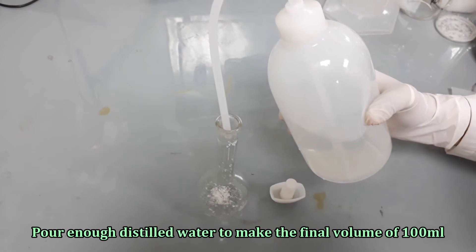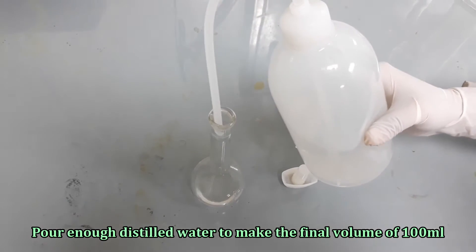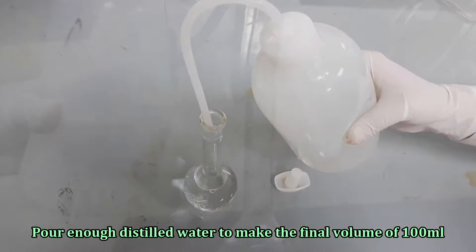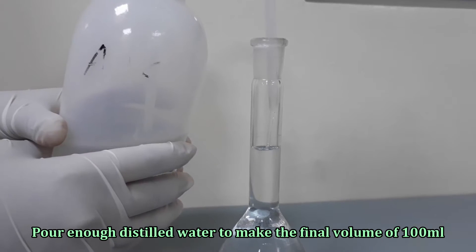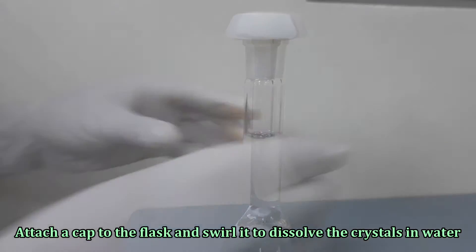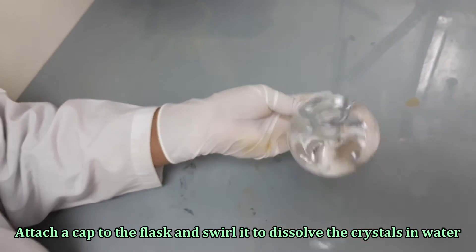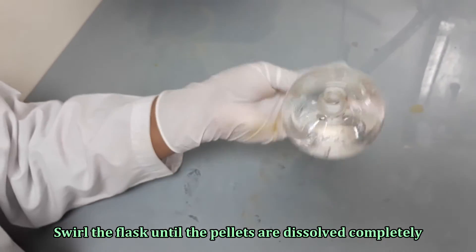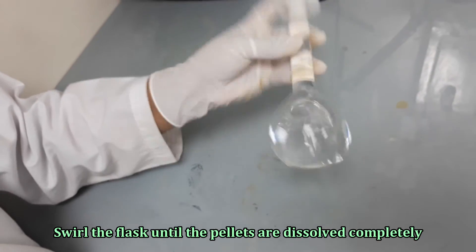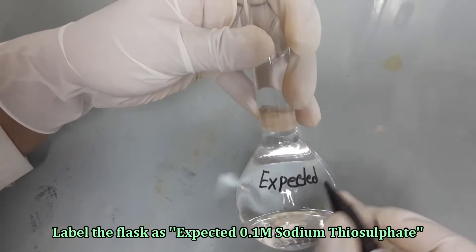Fill the flask with distilled water up to the mark. Swirl the flask to mix the solution. Label the flask as expected 0.1 molar sodium thiosulfate.